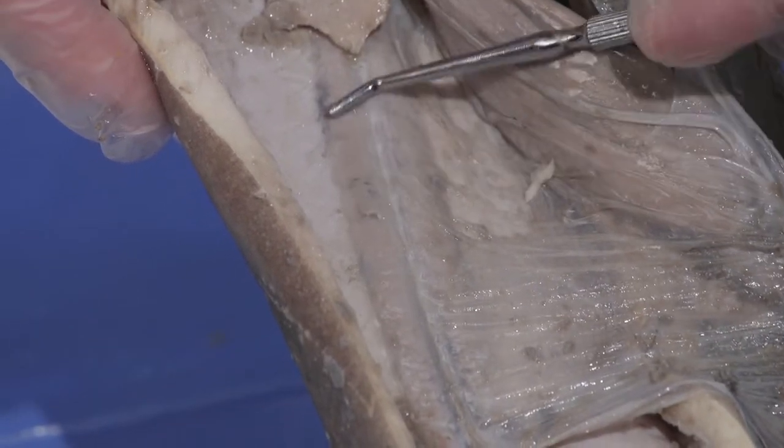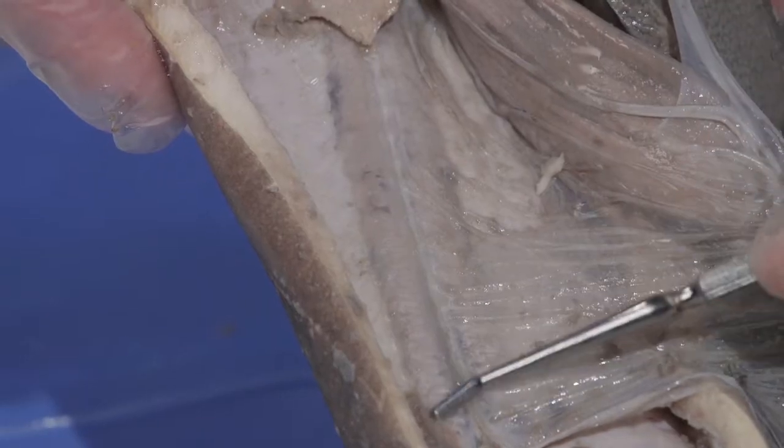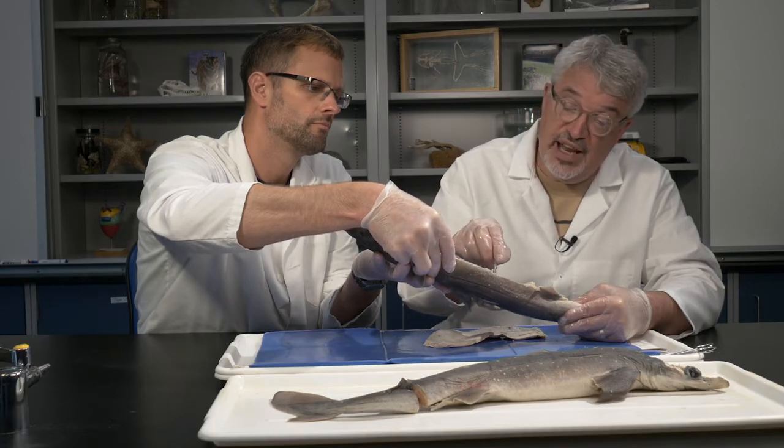This raised area right on either side of the spine, running down the back of the body cavity, is the kidney. The sperm duct runs all the way from the testes down to the cloaca.